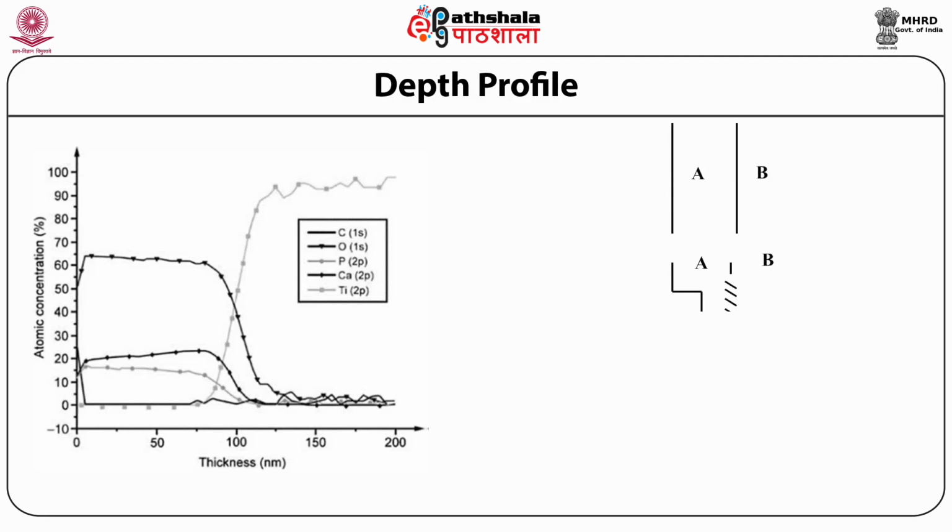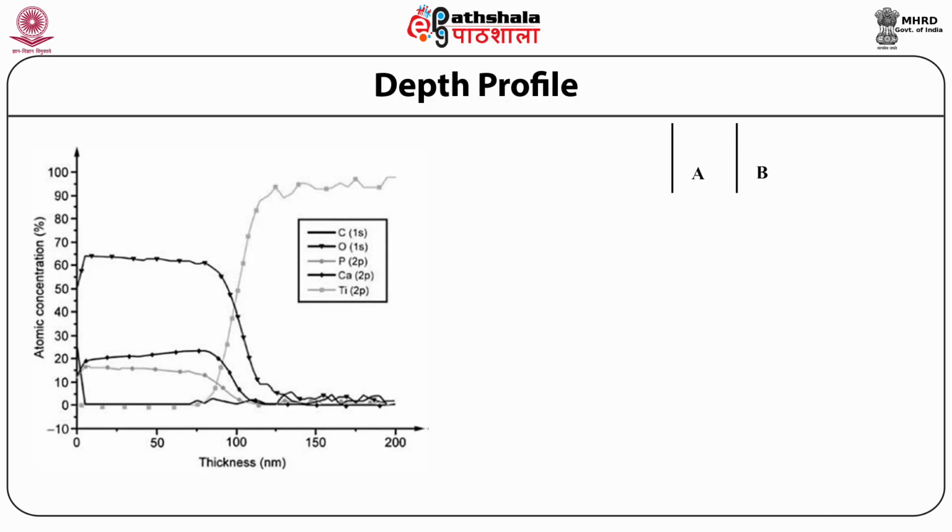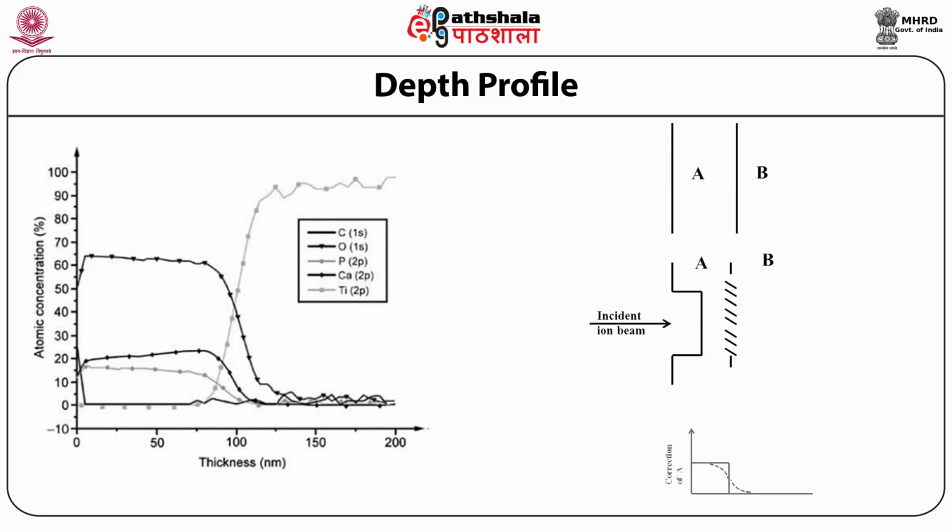Quantitative analysis of a depth profile, in addition to quantify concentrations, requires accurate depth measurements. There are several factors for resolution of issues raised in depth measurements. First, the etching rate for each type of atom is not constant even though the ion beam energy and ion density are exactly the same.